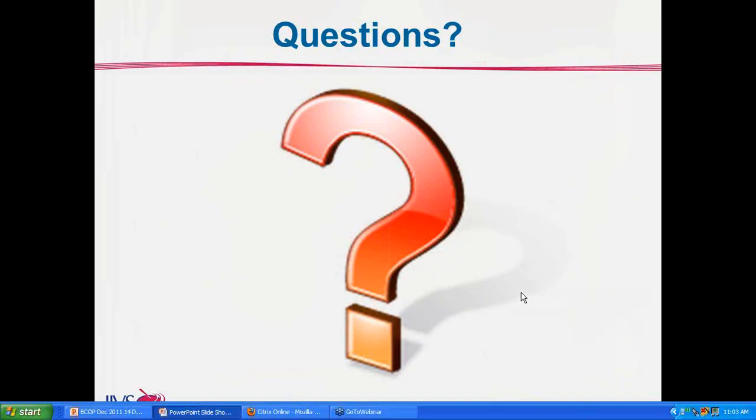There's a question that came in. Please tell us the vendor for the opacitometer. So, Susanna, this is for you. Well, thank you very much for the question. When we started to establish the BCOP in our laboratory, we experienced that it's not very easy to obtain an opacitometer. So what we did is we rebuilt one, and we actually now sell it, to make the technology available to people that want to establish this method. If you want some further information, just write me an email and I'll get a quotation to you.